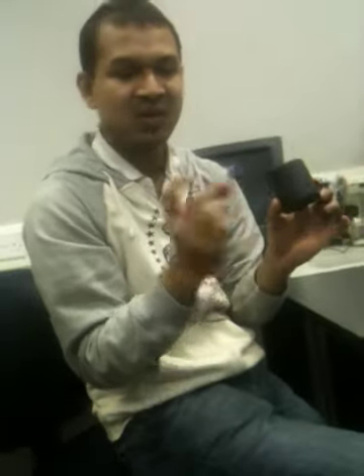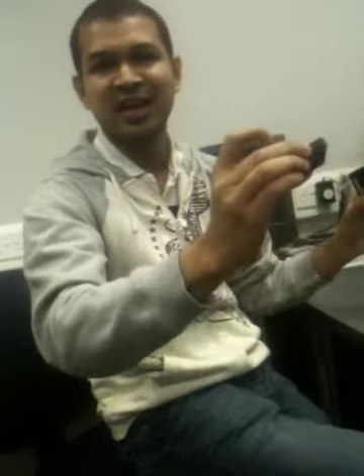Okay? And green means something in between. So that's how you're telling the machine that this is the standard. Now I'm calibrating it, and now you can measure things. Usually we calibrate every 8 hours, or you can make it less, but usually not more than 8 hours. 4 to 8 hours is common, 8 hours is kind of the industry norm, okay? Now, how will we do it?